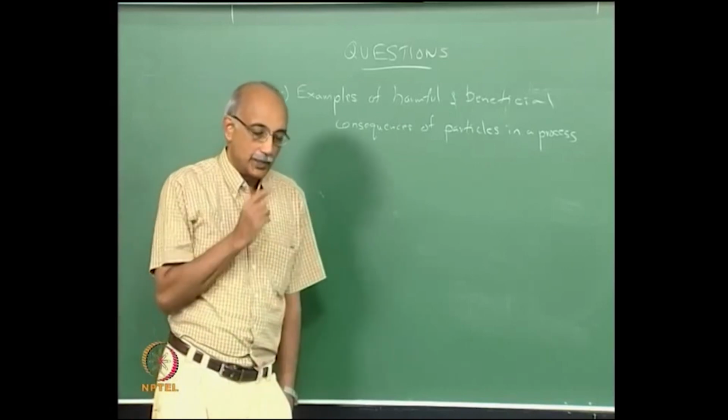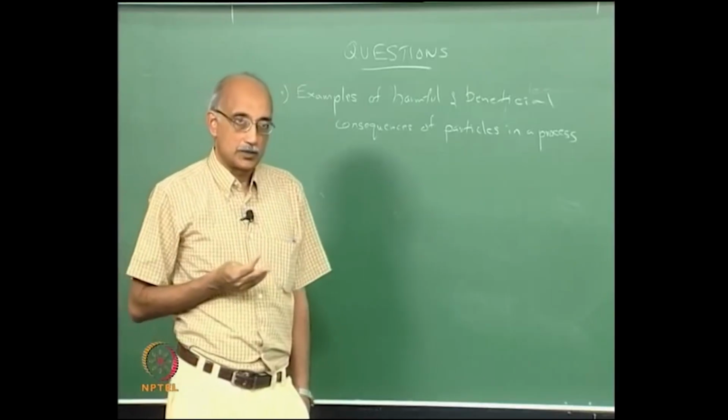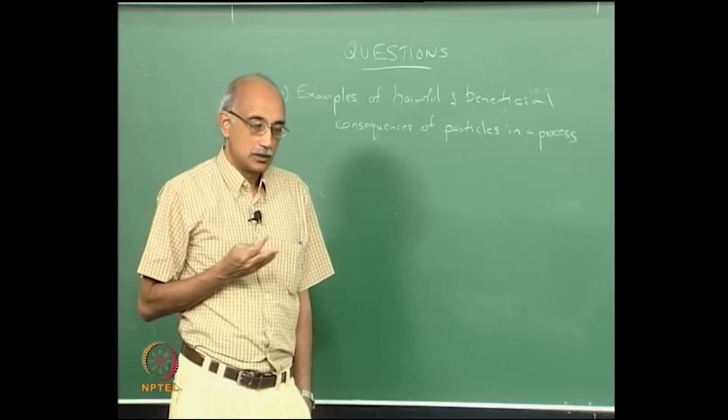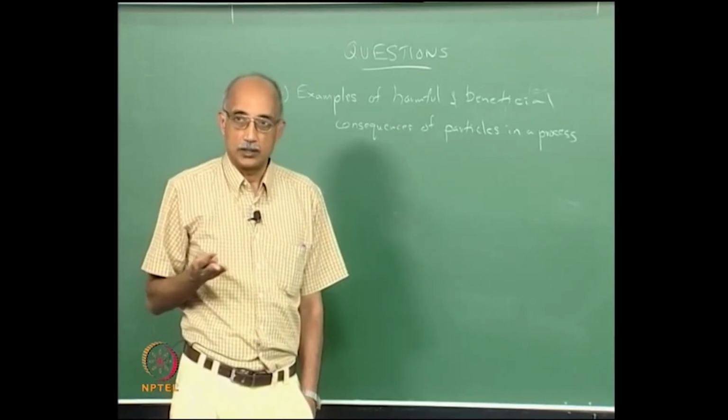Later, we started discussing the various aspects of particle characterization, and one of the things you should also be aware of is how do you classify particle characteristics.